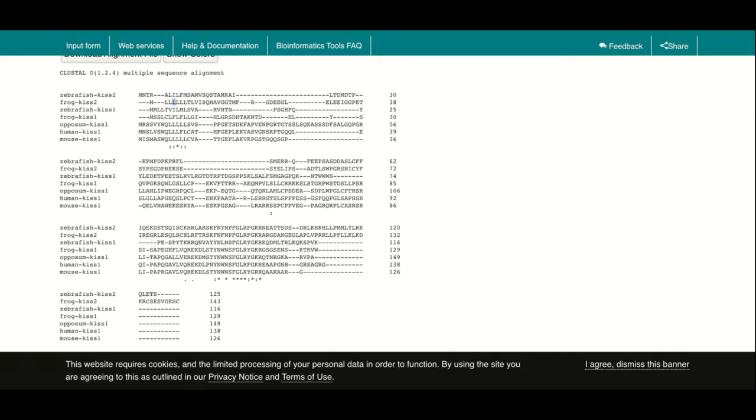Isoleucine and leucine sound pretty similar, and actually they are. So you look at the table and you will see isoleucine, leucine, and then phenylalanine, that's the F. You don't have to memorize that. You can just type amino acids table, and you will see the names. They have 3-letter names and 1-letter names for the amino acids. But what I want you to figure out is, what do the two dots mean? It has to do with how much conservation there was.